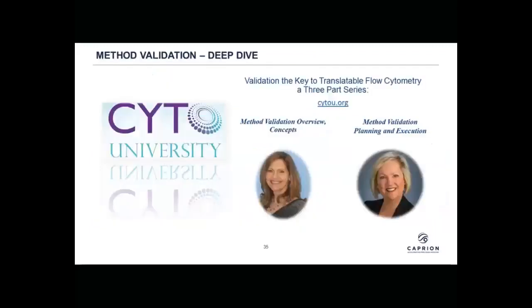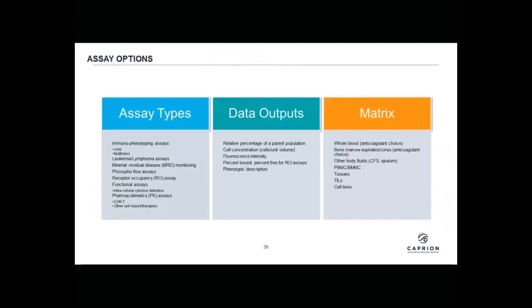Now for validation, two of the webinars I mentioned earlier have gone into a deep dive on validation, so we don't need to address that today, but they're available for download if you're interested. So let's look at our assay options. So our assay types, what do we want to do?